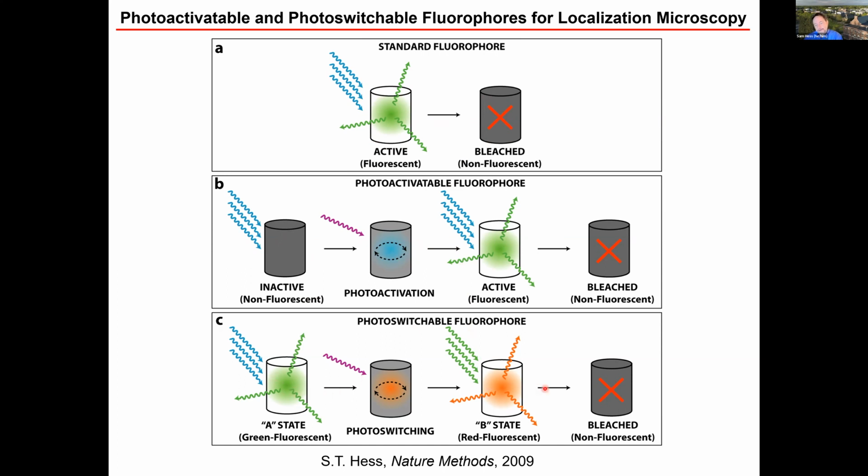We could use something which goes from dark to bright, or something which goes from one spectral region to another. For example, a photoswitchable protein, or photoconvertible, as some people call it, which starts with a green spectrum and is then converted to a form with an orange emission. And thus, in the orange channel, it goes from dark to bright, but in the green channel is visible for most of the time and can be imaged with conventional methods.